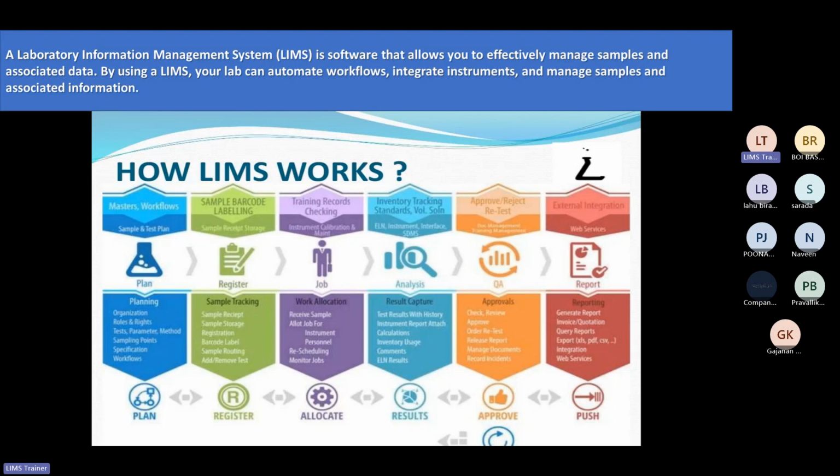Then comes the inventory. Do you all understand inventory? Basically, whatever inventory is involved in the laboratory, starting from the instruments, equipment, the glasswares, or the HPLC columns, everything that is required in the laboratory is required to be controlled, because the lab manager should have an idea how much cost is involved in the laboratory.